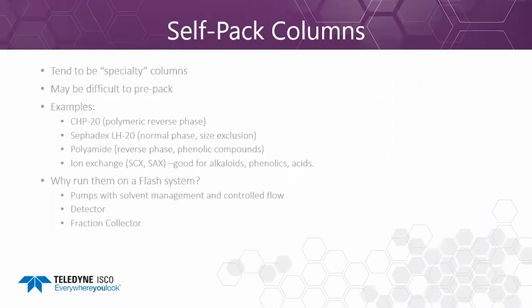Specialty columns include Sephadex LH20, which is normal phase and size exclusion, CHP20, which is polymeric reverse phase, polyamide, which is generally run as reverse phase, but with phenolic compounds, and ion exchange columns, which are good for alkaloids, phenolics, and acid. So why would you run them on a flash system? Well, first off, you get all of the advantages of a flash system. So you get solvent management, controlled flow, you get a detector and a fraction collector that runs automatically.